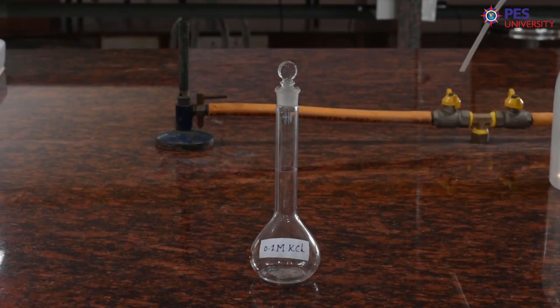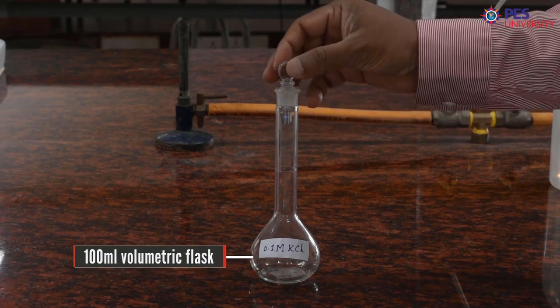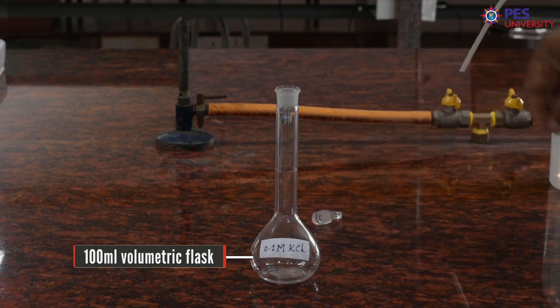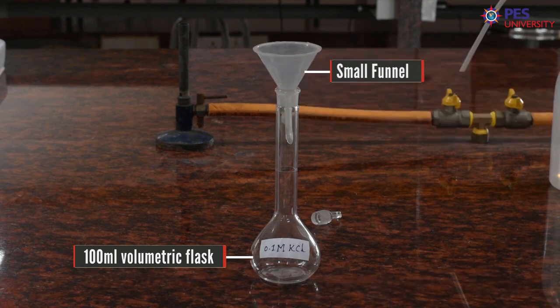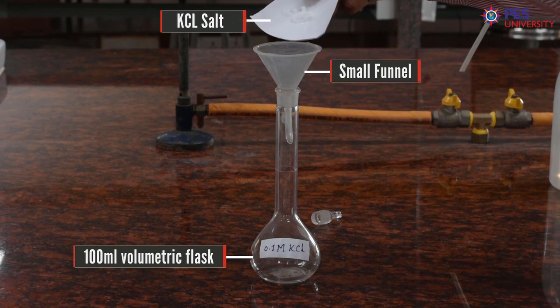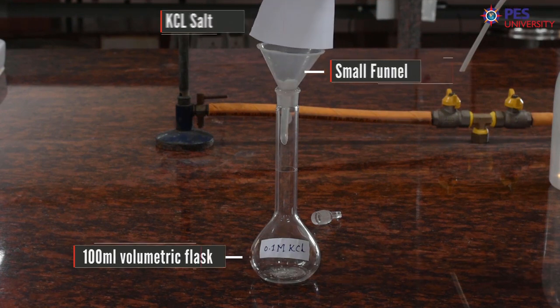After weighing the salt, take a 100 ml volumetric flask. Then take a small funnel and keep it on the flask. Then transfer the salt carefully onto the funnel like this.